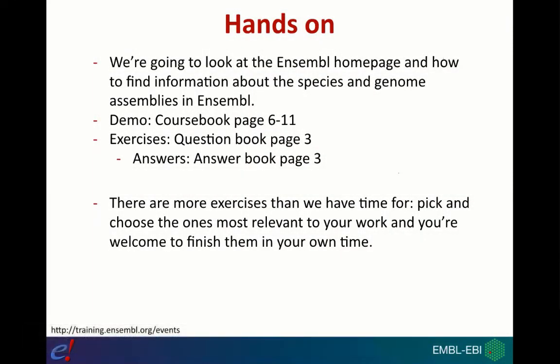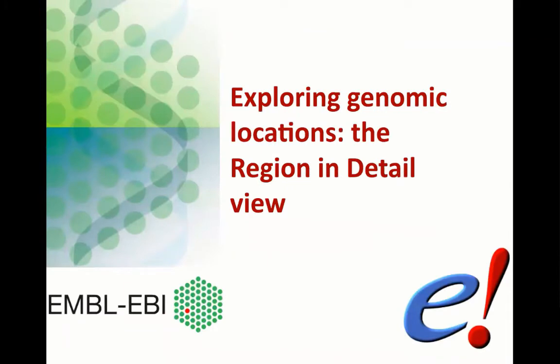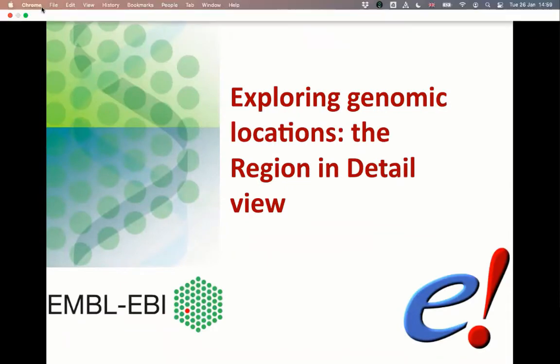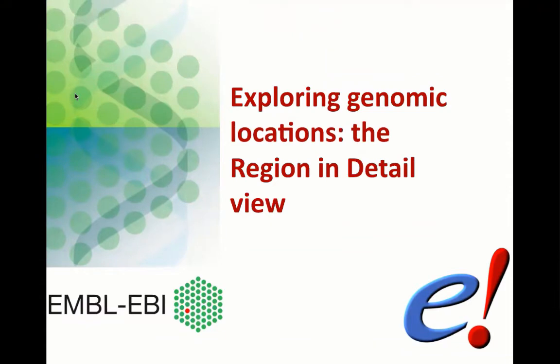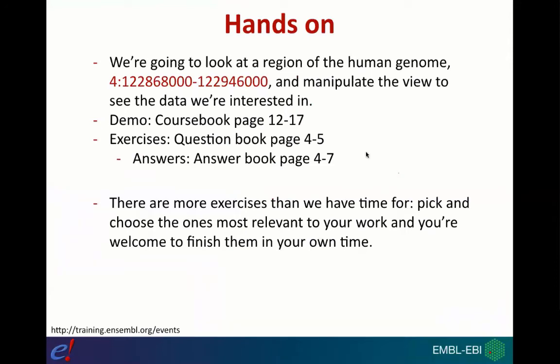In the next part of this module, we're going to begin exploring the Ensembl Genome Browser itself — specifically a page called the Region in Detail. We're going to look at a region on chromosome 4 in the human genome with specific coordinates, and then manipulate the view to see data in relation to this region of interest. If you're following along in the course book, screenshots start on page 12.